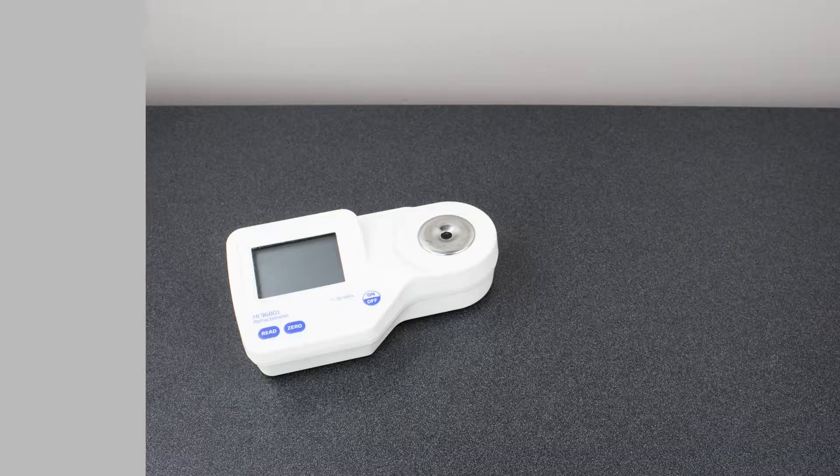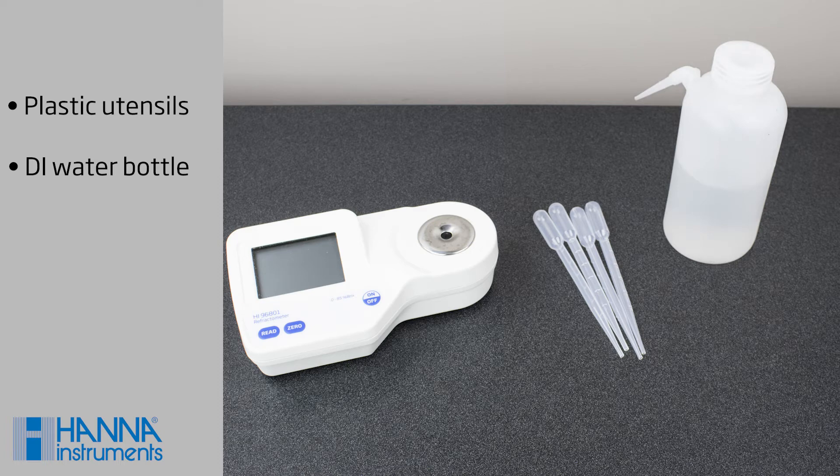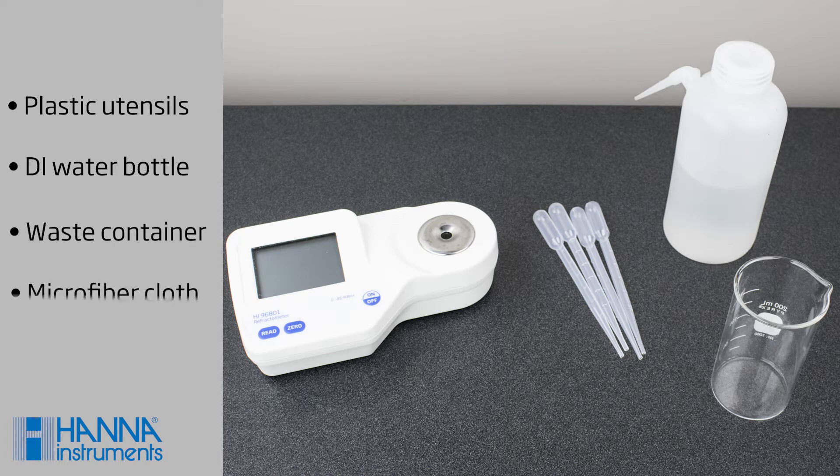For this, you'll need to keep some simple materials on hand: plastic spoons or pipettes — these are helpful for adding or removing samples, and metal spoons can scratch the refractometer prism — a squeeze bottle for DI water, a waste container, and a microfiber cloth.